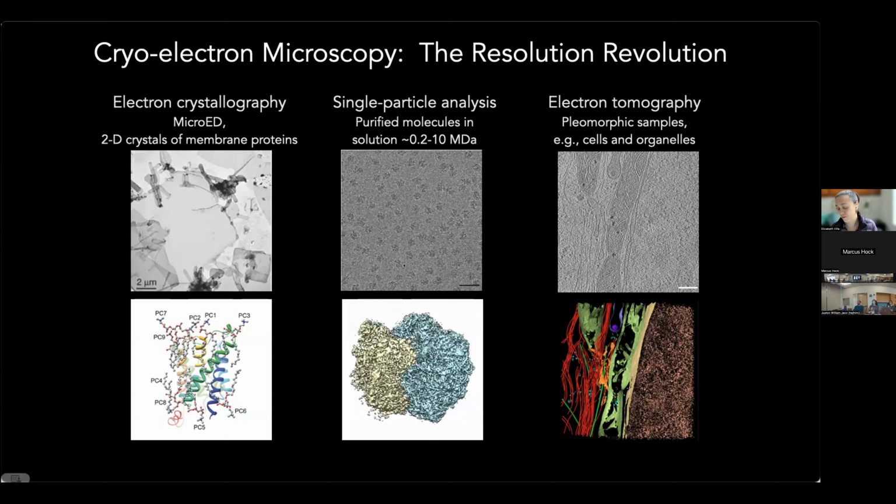The more famous one that you'll probably see constantly on the cover of nice journals is single particle analysis, where you purify molecules and you basically make a monolayer of these molecules embedded in ice. And if you're lucky, they're captured in a lot of different orientations.